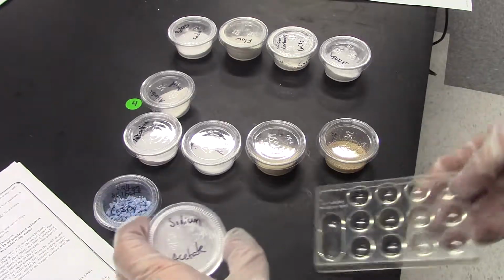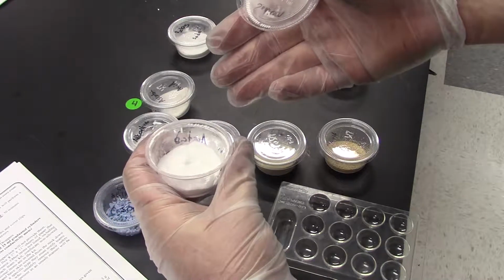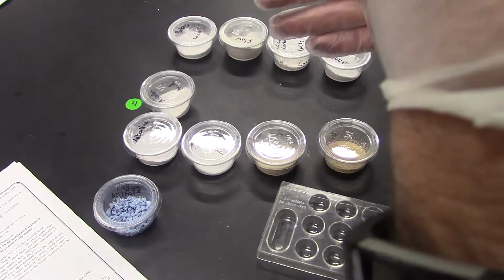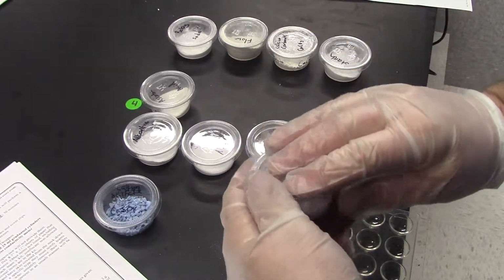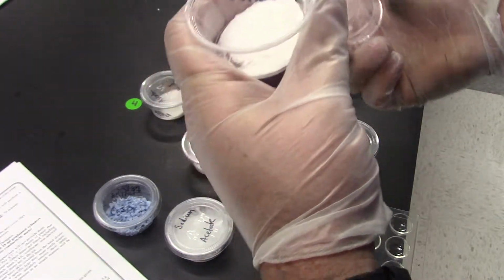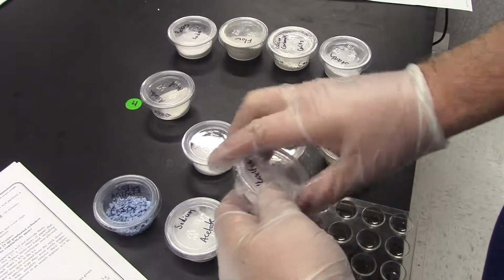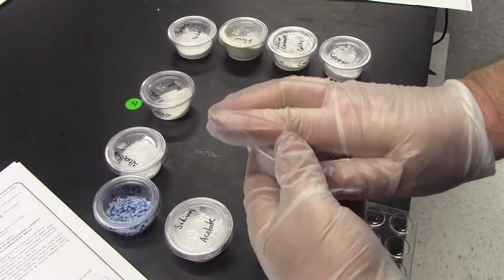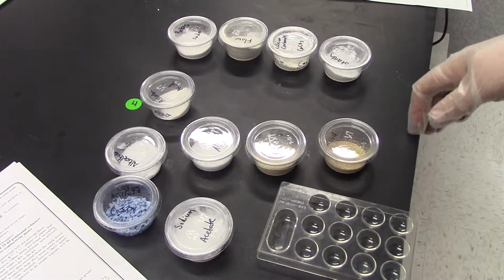It's very powdery. If we take a waft, and you don't want to put your nose in here and just sniff it, that could cause all sorts of problems, but if you just very lightly smell it, there's not much there. There's no vinegar-like smell, so we can't use smell for that one. Most of these white powders probably aren't going to give much of an odor off. I'm not smelling anything, so I would highly recommend you don't even bother smelling these. Liquids, definitely, you want to smell them, but the sense of odor is not extremely reliable.